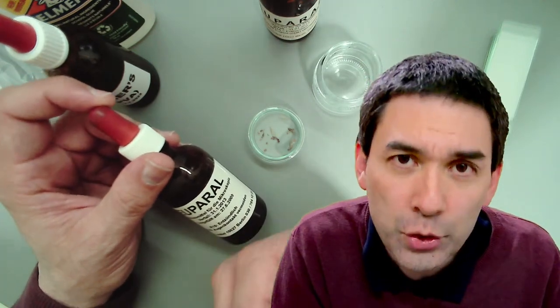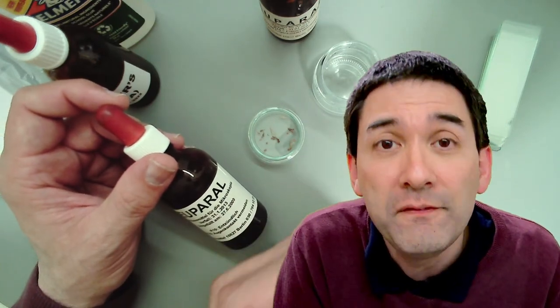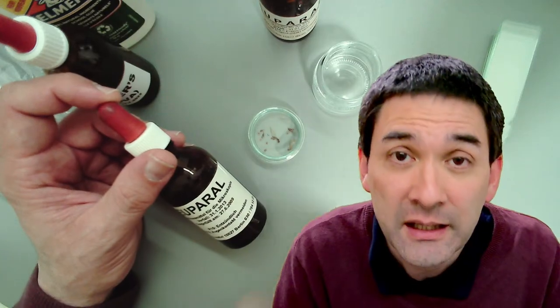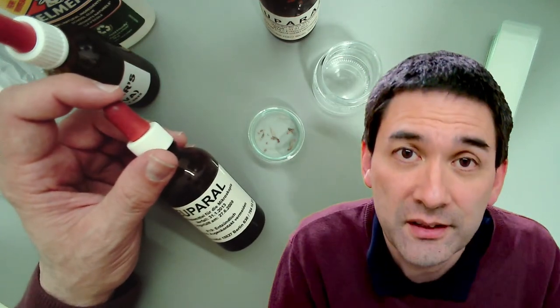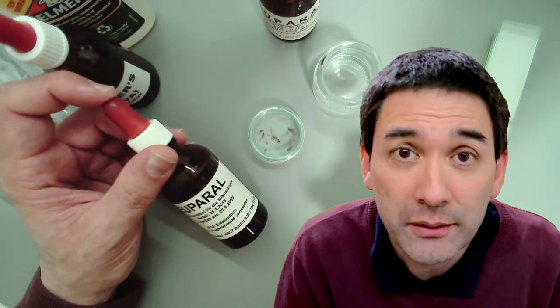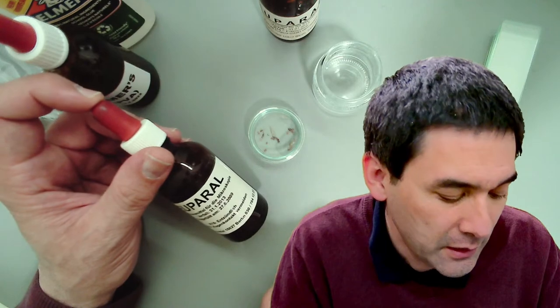So usually when you mount little insects, flies, mites, whatever, they appear to be very dark, because generally you make a whole mount, and for whole mounts you basically just take the whole dry specimen and put it on the slide, and then it's too dark. But for whatever reason, Euparal has the nice tendency to clear the specimen. Normally when you don't use a medium that clears, you have to process the specimen somehow, kind of bleach it so that it starts to become clear and transparent. But with Euparal, you don't have to do that. That's one of the nice things here, and that's why I'll be using Euparal.